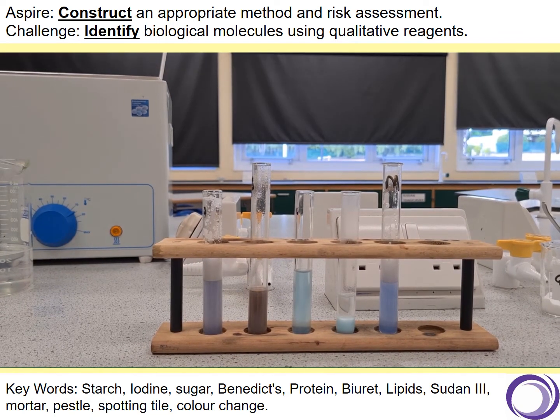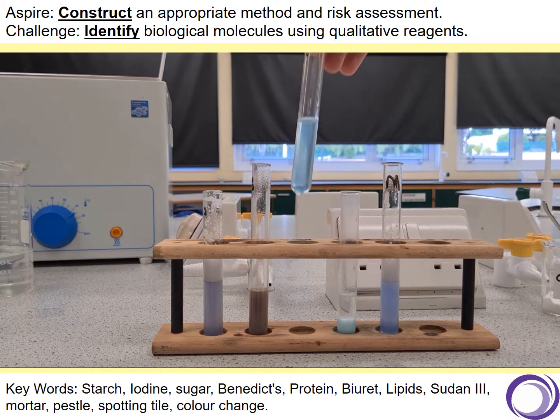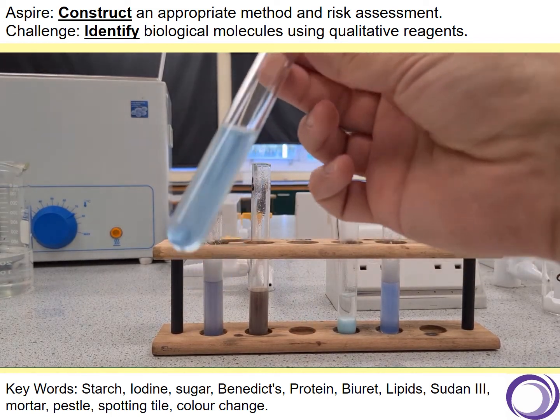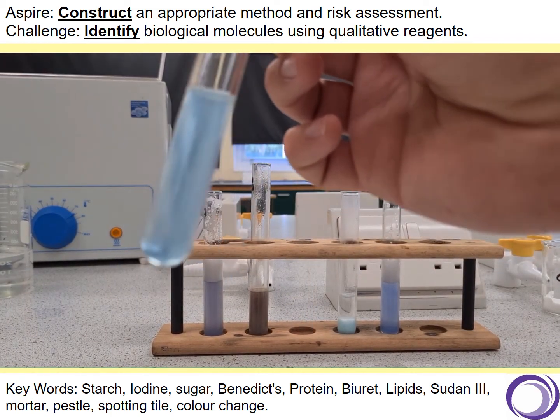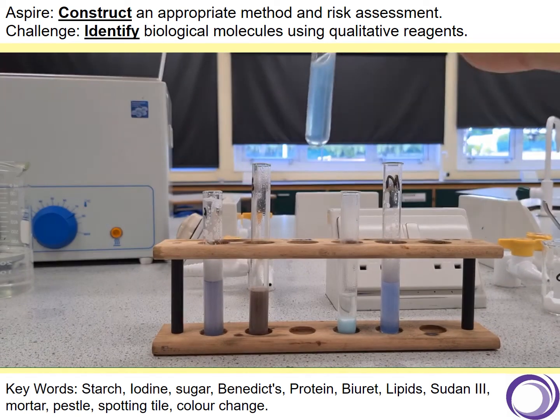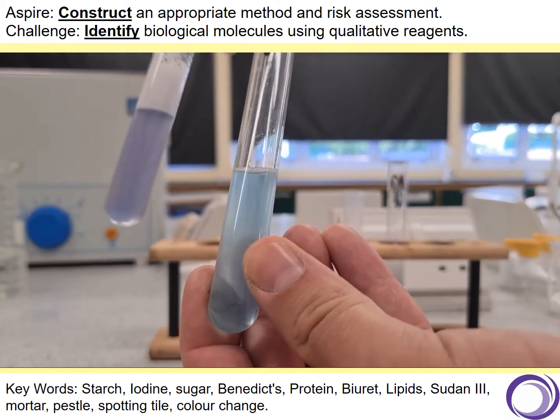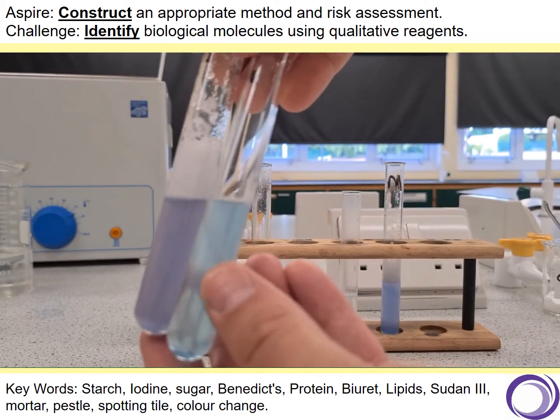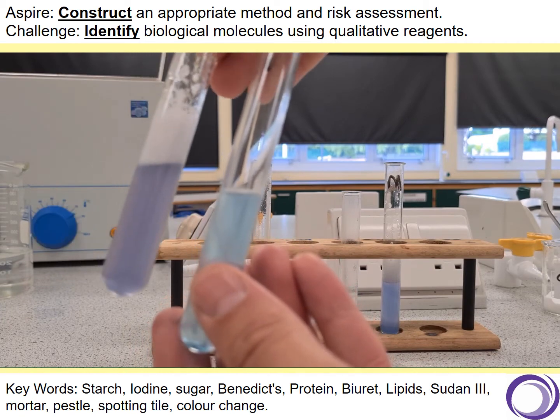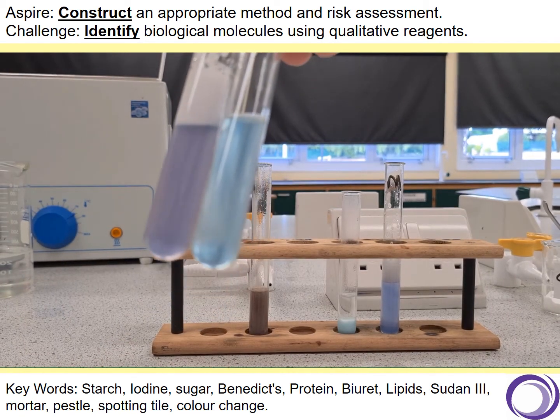So we've left these for a while now. We'll just go through these results. So if you can see this one here, which is the glucose syrup, that has not changed at all. Okay, it's still that light blue colour, so that has not got any protein in, surprise, surprise. If I match that against this albumin here, and you see the colour change there, this one's got a purple colour, which means it's got protein in, which is not a surprise because it is a protein.